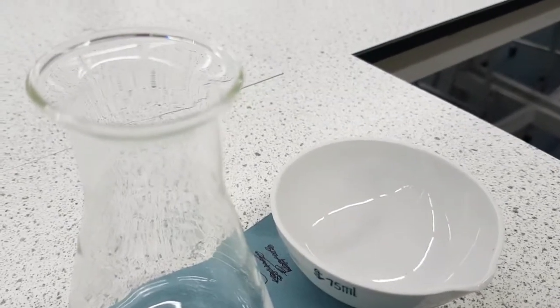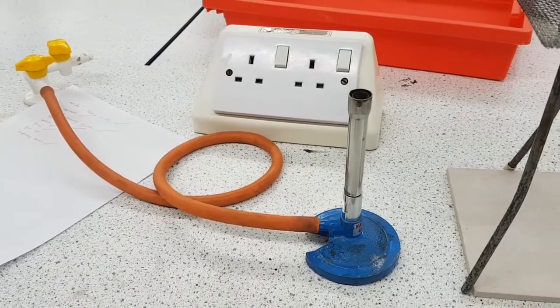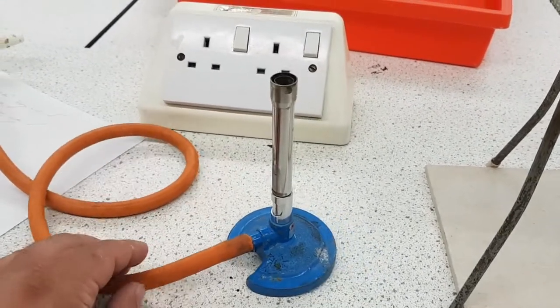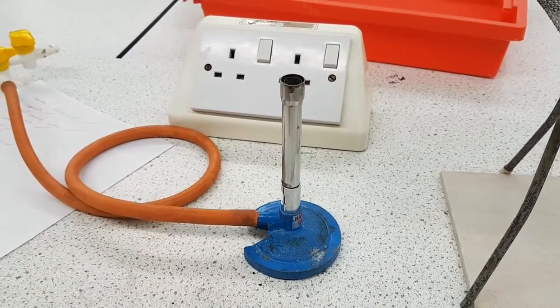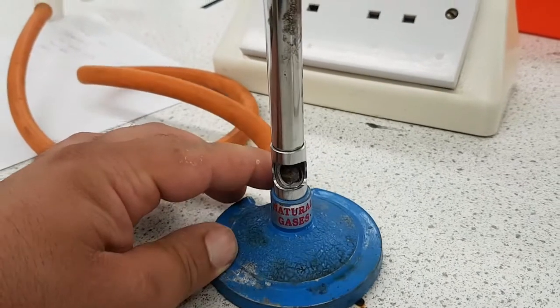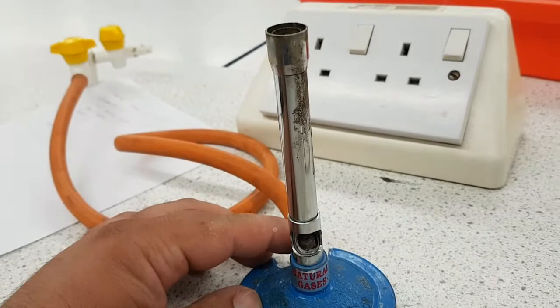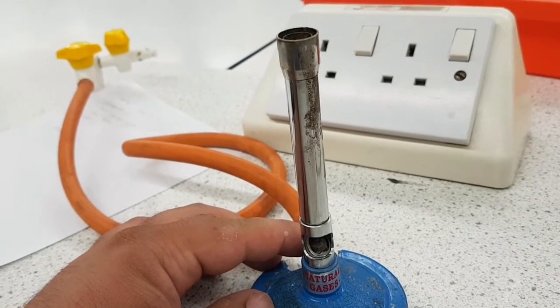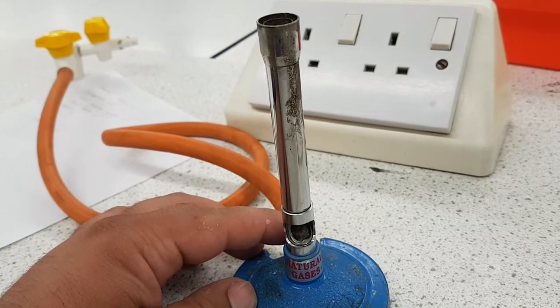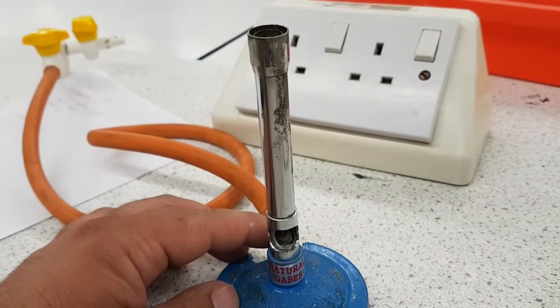Let's go through the procedure for real. But first I want to teach you how to use a Bunsen burner — it's shocking how many students go through all their school life and cannot use a Bunsen burner properly. When the hole is open, lots of oxygen go into the Bunsen burner, meaning you have a complete combustion reaction, and so you'll have a blue roaring flame. That flame is for heating.